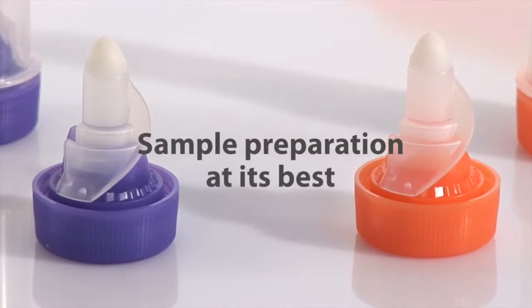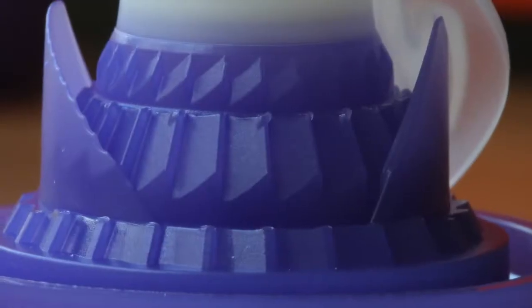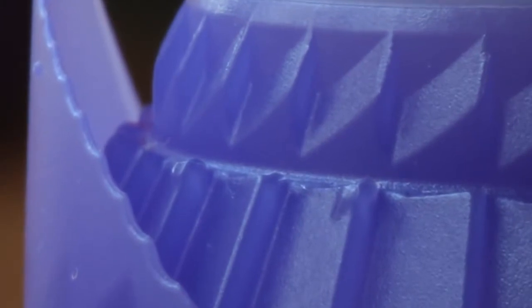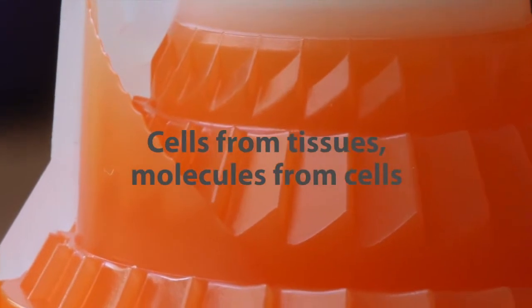Both tubes ensure the very best sample preparation. They share a lot in common. Look at their stator and rotor systems — precisely defined mechanical shearing gently pulls cells from tissues or intact molecules from cells. No matter the application, both tubes are great.